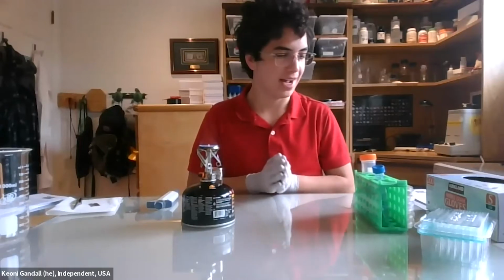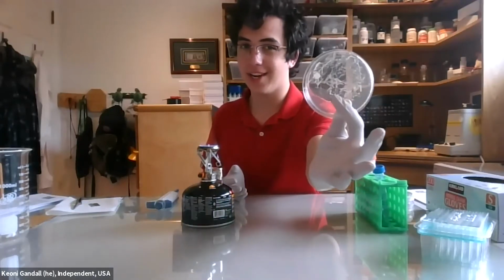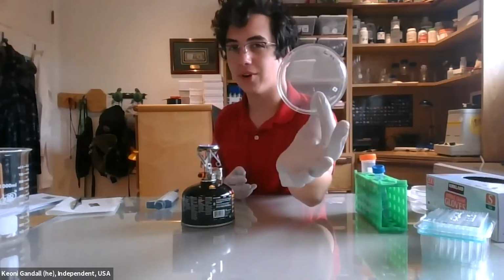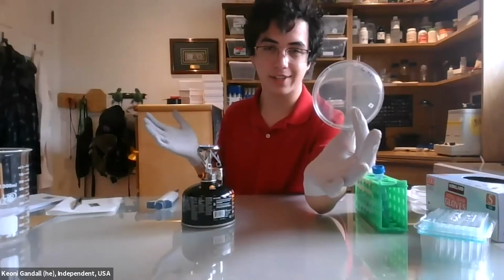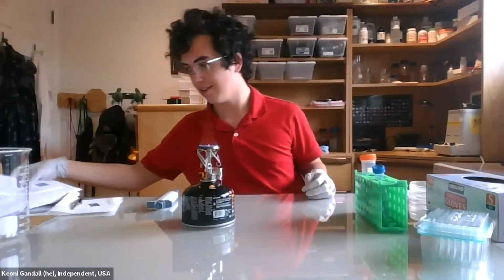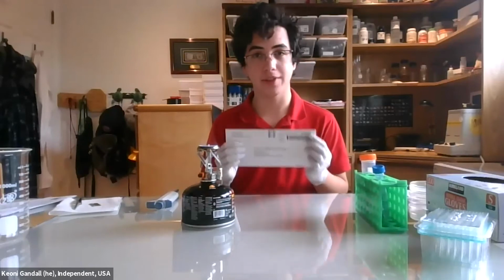So there you go. That is the Sporenet protocol. It can actually get DNA back. All you need to do is cut it out, put it on a dish, put that in the incubator overnight. You have Bacillus subtilis strains. You can ship them in letters at room temperature. They can store for decades.